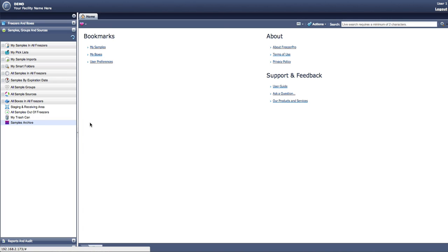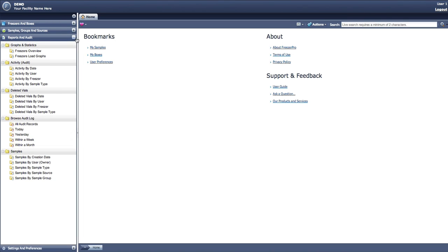The third major section is for reports and audits. In order to view this section, a user must have the Access Reports and Audits role right associated with their role. In general, the default roles that have access to this section are the Administrator, Manager, Power User, and User. The Guest default role does not have access to this section. The tools associated with this section of the software will be covered in their own respective tutorials. However, for user interface overview purposes, we will note each tool.